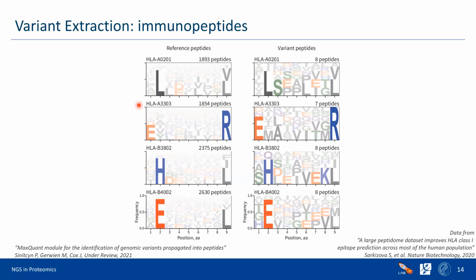But next, we take again the cell line with no HLA proteins at all. We insert another HLA, A3303, and we take all peptides from the surface which are present thanks to this protein, and we sequence them using proteomics. And it's really possible, and you see we're detecting a reasonable amount of peptides. And we can do it with many HLA proteins. I have to tell you that HLA is one of the most variable proteins in the human genome, so it's no surprise. This study, I think, already has hundreds of HLA proteins. And this really represents variability in the human proteome, in the human population.